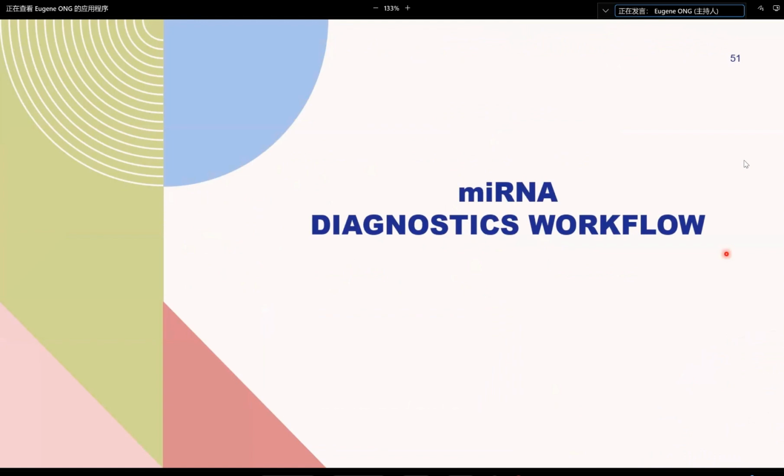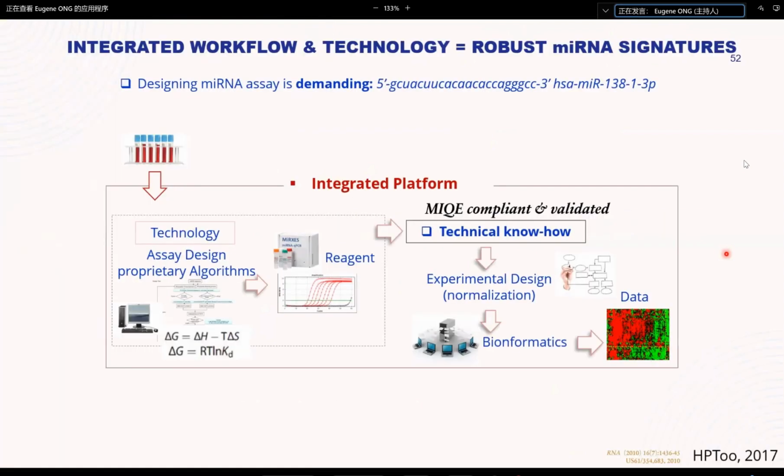So in order to identify these microRNAs, they have used a simple PCR test. They say that designing the microRNA panel is demanding because of the thousands, and then you have to cut down and identify the few which are very specific. However, once you are able to do that, it is essentially a qPCR reaction.